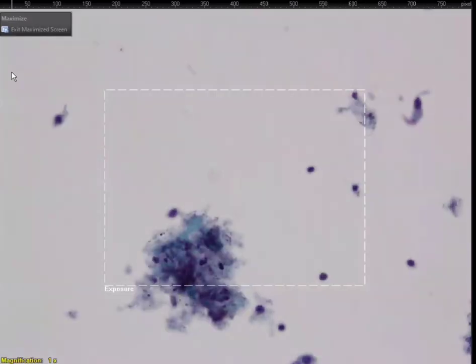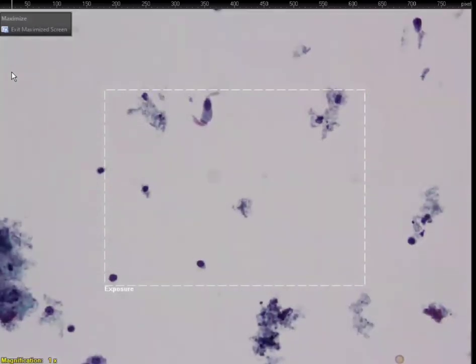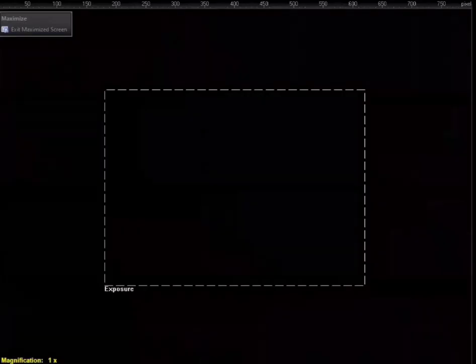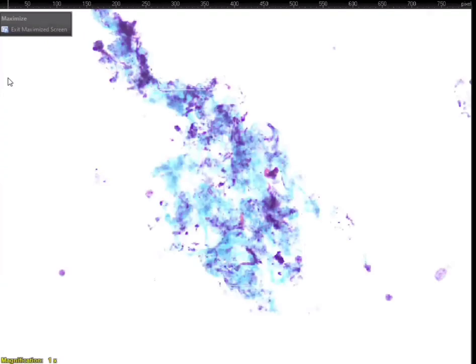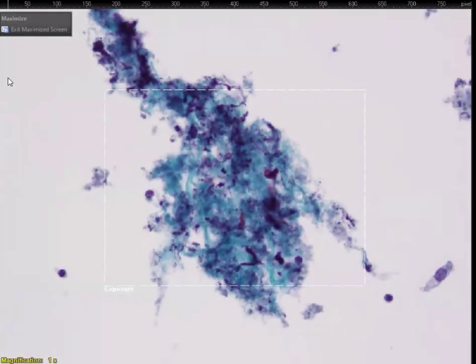You remember I also told you granulomas can have a very hard shell, and sometimes the needle slips off, right? It can't penetrate through that hard shell. So perhaps it's a situation like that, but still, that's not our problem. We can't make a diagnosis if we don't have good cells, right? So you can say necrotic junk, right? Looks like junk, but not good.